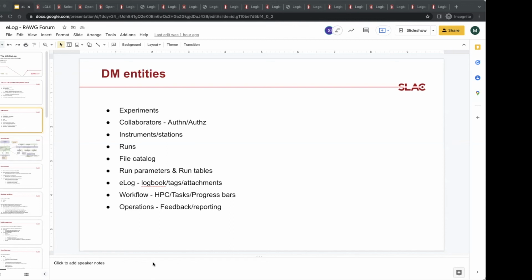In addition, we have the ability to automatically trigger analysis jobs in the workflow. And so based on data management events, we typically talk to Slurm, and based on some data management event, we can kick off a Slurm task or a sequence of Slurm tasks or an Airflow workflow tasks.